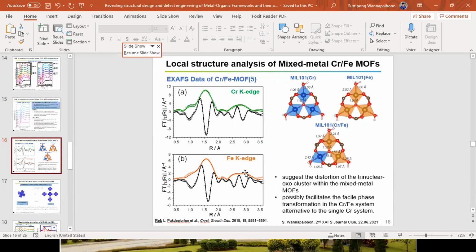That's why it ends up with that kind of big bump. Those are multiple scattering peaks, from those two different oxygens here. The multiple scattering is around 3, which is what we get from the simulation of the model structures, combined with the elongated iron-oxygen bond of the carboxylic acid here. So it's a combination of the two.